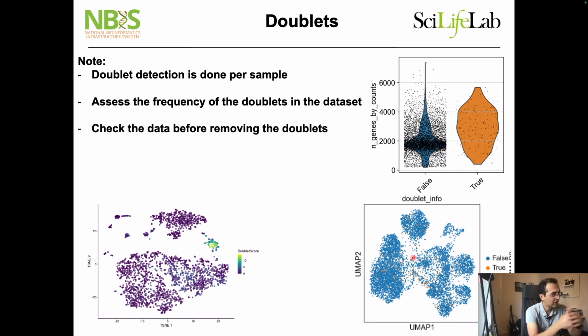So if you had done some differential expression analysis, I think you would identify some genes differentiating this group of cells. On the right-hand side, you have a UMAP. UMAP and t-SNE, I will talk about them very briefly, but it is one way of reducing the dimensionality.